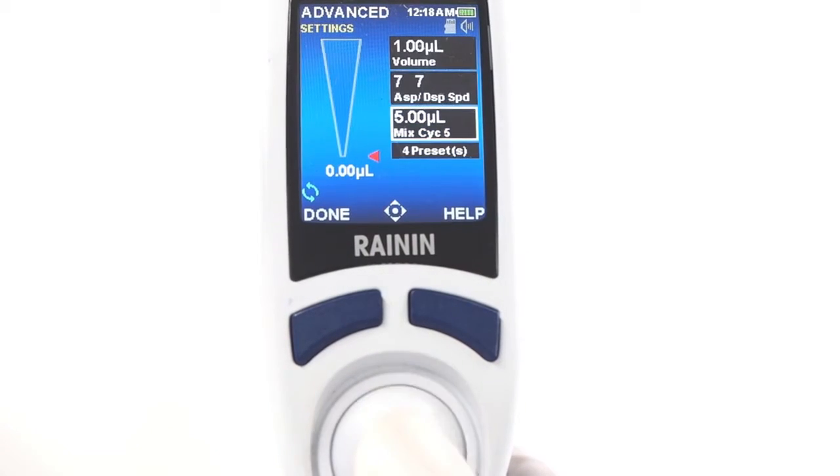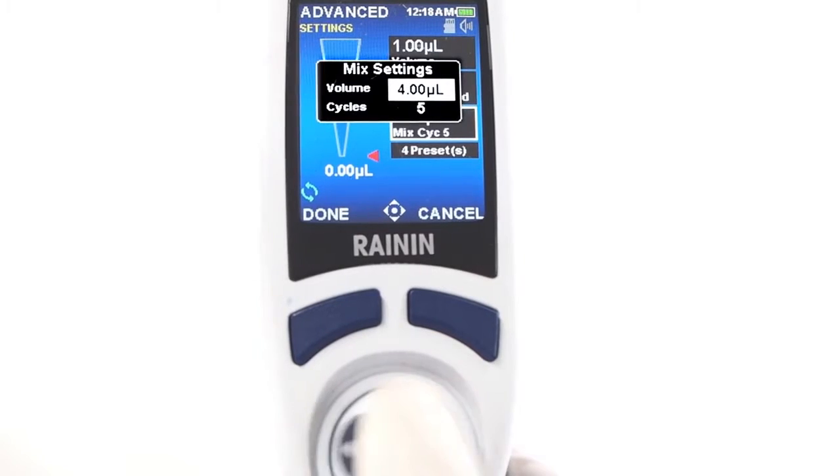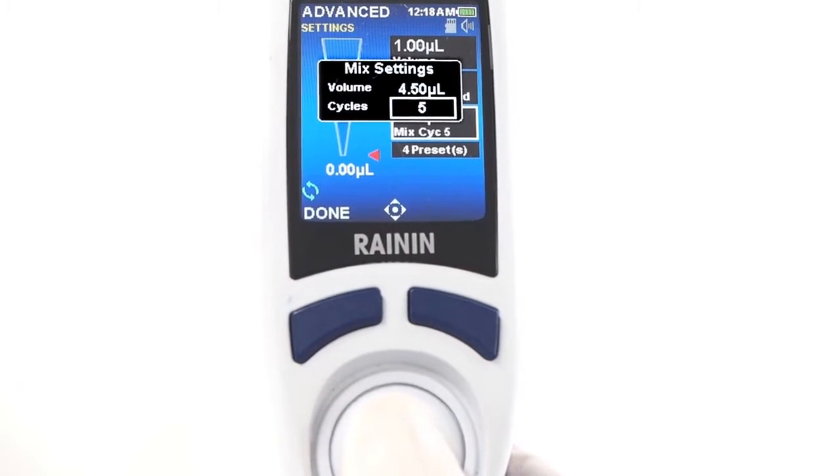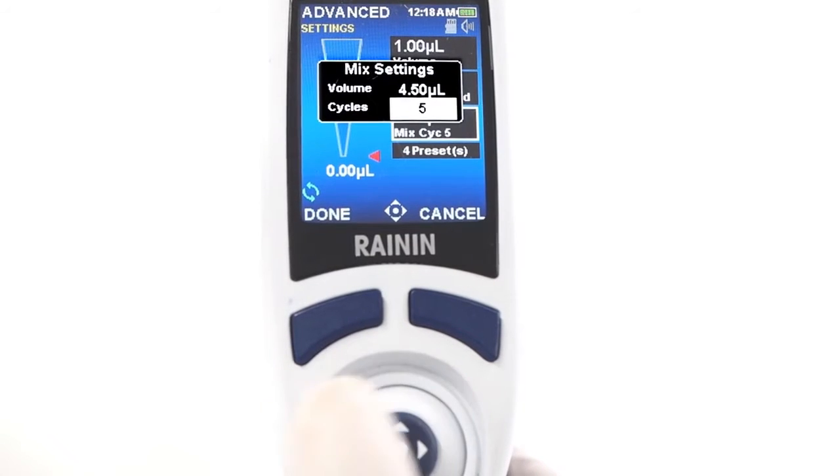Joystick right into settings, move down to the mix box, and press. Here you can adjust mix volume and the number of cycles for your samples to automatically mix. Press done to set.